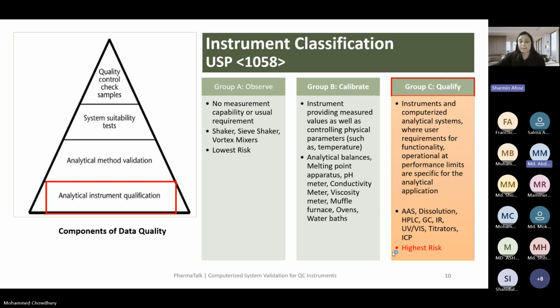Yes, you have to challenge it. Sometimes we use ANOVA, and other times we use a 4PL parametric system to measure the potency, and sometimes we use the linear system to measure the potency. These depend on the data I am getting from the analysis, let's say ELISA analysis for our biological lab. So actually, how should we perform the validation of this software system that performs the calculation?